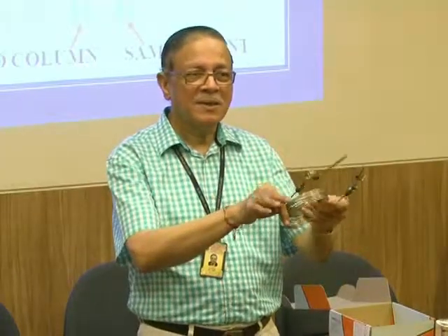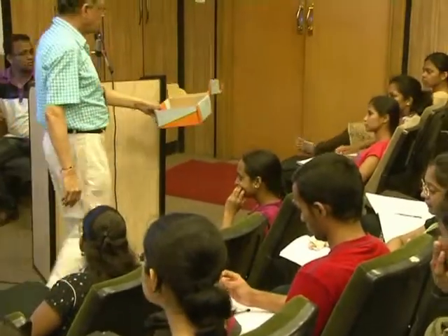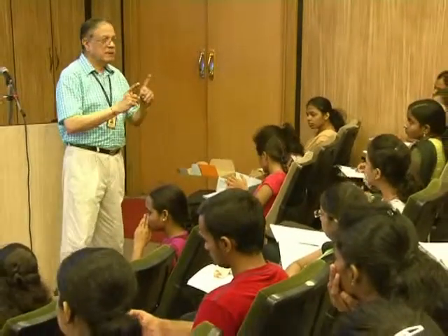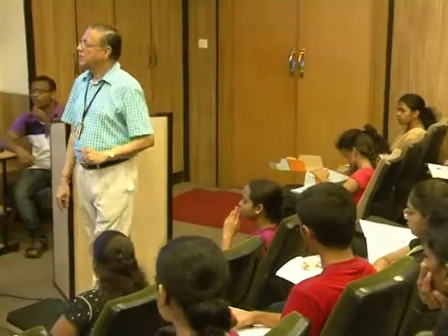One end goes to the injection, other end goes to the detection. So solute mixture passes through this heart, and then separation is brought about, and then detection is done. So you can see the diameter of the column, and you can also see capillary. This is the capillary column, and when you see the packed column, you will be able to see the difference in the diameter.